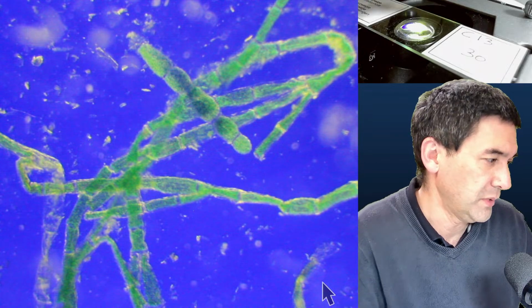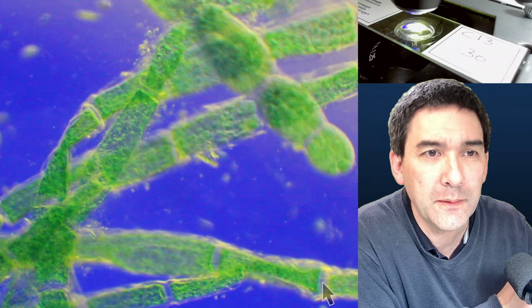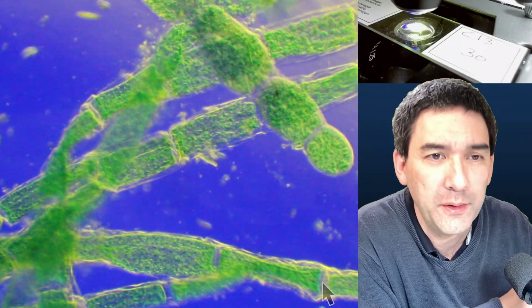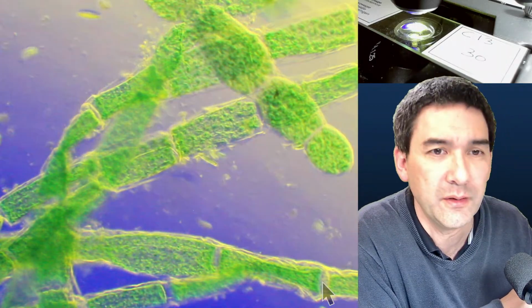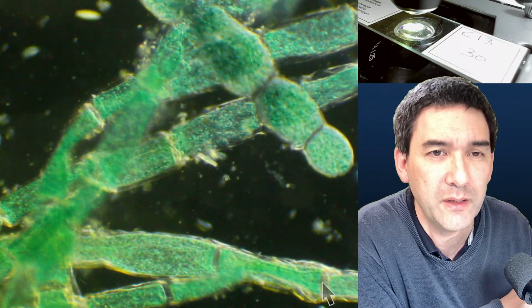That's the 4 times, let's try the 10 times. Yeah, because the condenser, of course, is open, therefore the depth of field is fairly low. If I do it like this, let's see. Then here we have, this would be dark field.